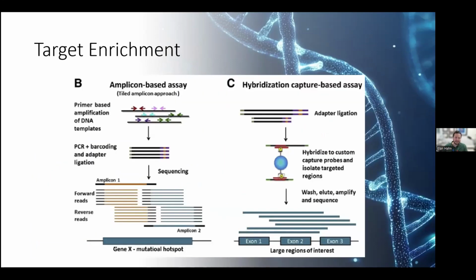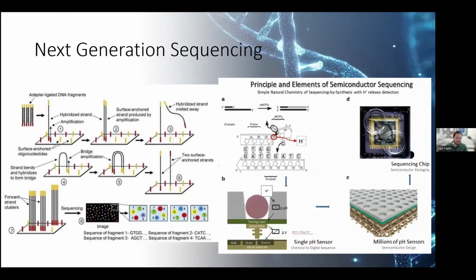And then we move on to next generation sequencing, where we essentially do the sequencing massively in parallel. So there are 2 main approaches: amplicon-based, which is amplifying targets to our target regions, and hybridization capture, which we select out by hybridization to specific probes. And then there are the 2 main chemistries, which is Illumina, where we create this lawn and have the bridge amplification, and then look at the light signals based on the fluorescent nucleotide that was incorporated. So we take multiple of these pictures through every wash cycle, and then build the sequence that way.